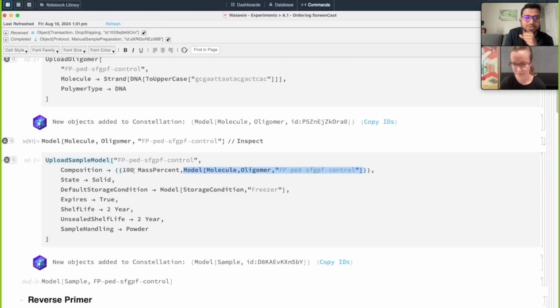Yes. So you'll have to specify the concentration of your oligomer followed by the diluent itself, or the amount of diluent there is. If it's water, you have to specify like 95% of the sample is water, the rest is oligomer, and so on.